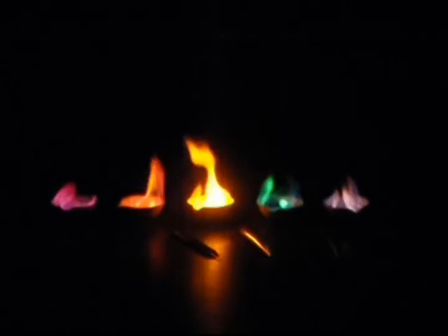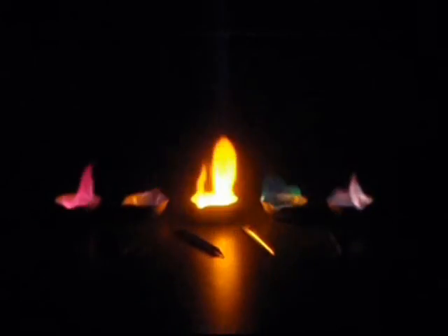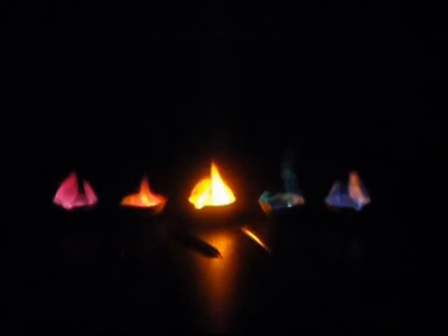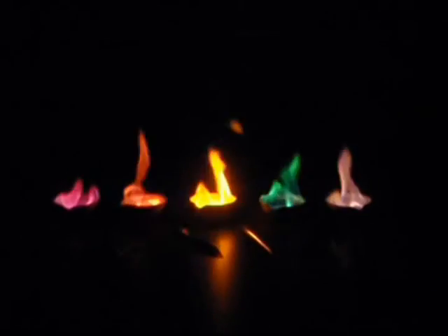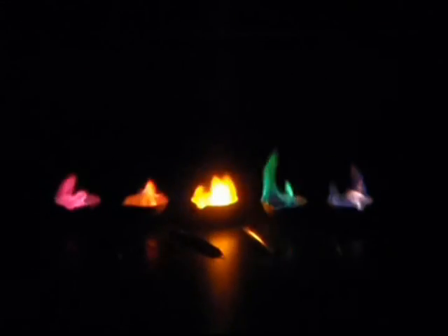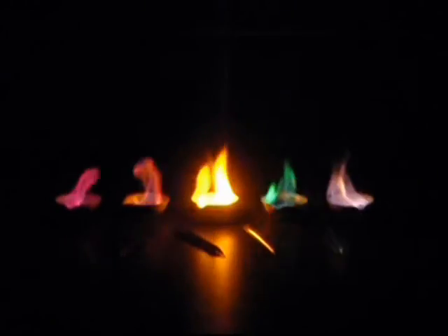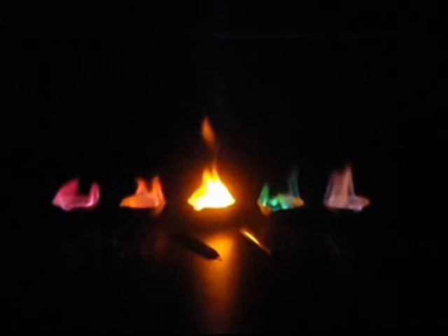Now as you can see here, our potassium, which is all the way on your right, is burning this nice violet color. Next to that, the green of the copper, the yellow-orangish color of the sodium, the lithium is the darker red all the way to the left, and next to that is the strontium, which has a nice red color to it.